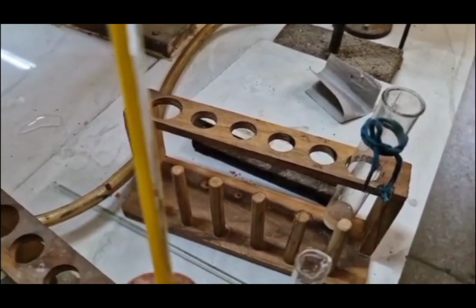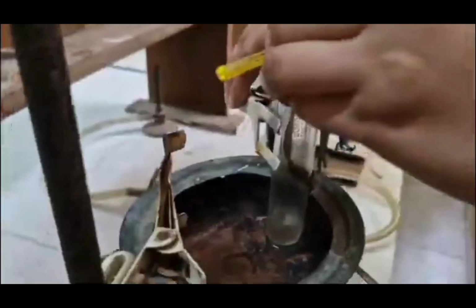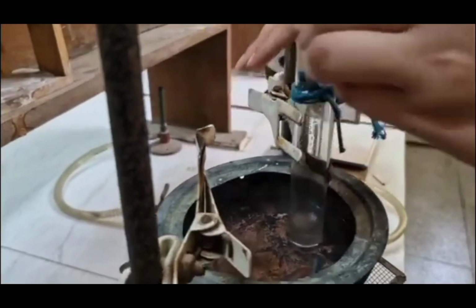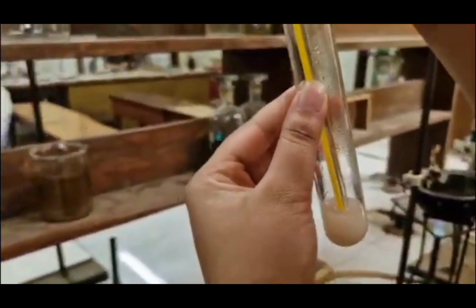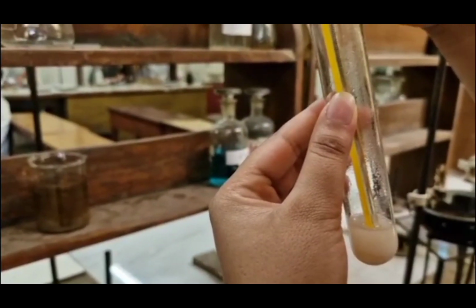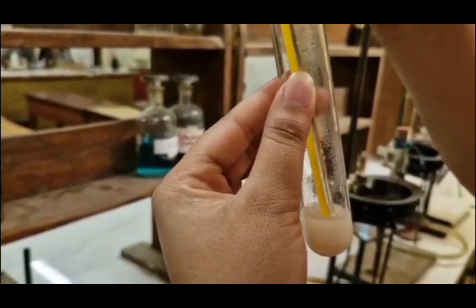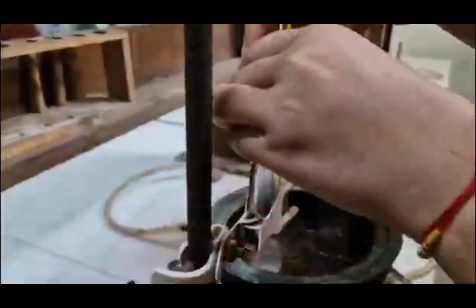Add 2 ml water again and note down the temperatures when turbidity appears. In our phenol water system, turbidity appears and note down that temperature. We will repeat this process several times until we get the CST of both systems. Again add 2 ml water in our phenol water system and heat it until the turbidity disappears.